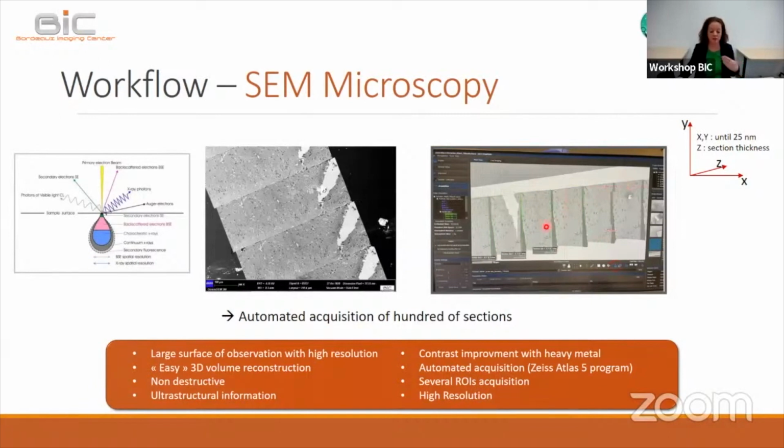And then we can also use the fluorescence that we did on the same section just before to target regions of interest inside. The program will collect all the information that we need and all the different images quite alone after. All the pre-processing phases can take days, but after, it will do all the acquisition alone.